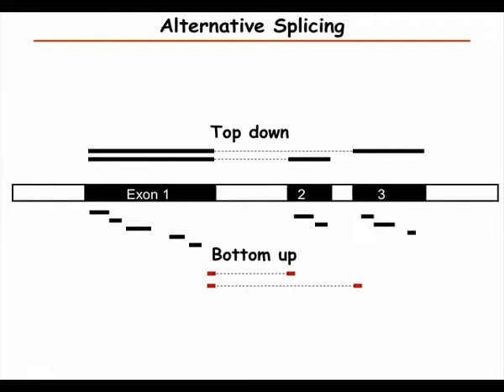But even when you have these really poorly behaving proteins, if you digest them with an enzyme, there will always be a few peptides that are rather well behaving in mass spectrometry. That's why bottom-up is so generally used, because you usually get a few peptides, not always, but most of the time.